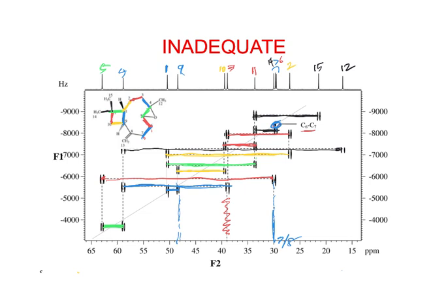Sometimes these polyacetates can have double bonds like this, and I think the actual acetates are between here and here and here and here. You run the experiment and you only see these two coupling and these two coupling. And it just tells you where the acetates were incorporated into the structure, because you have these little pieces that show up very well in the experiment.